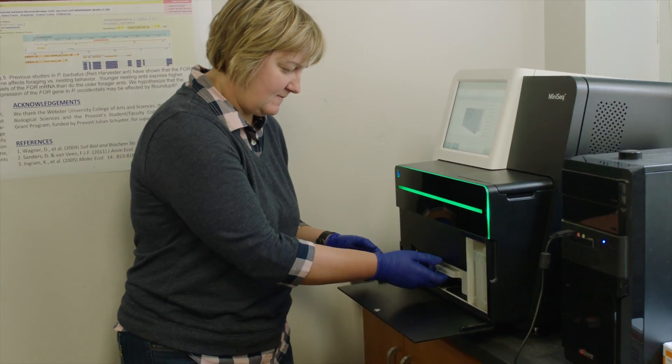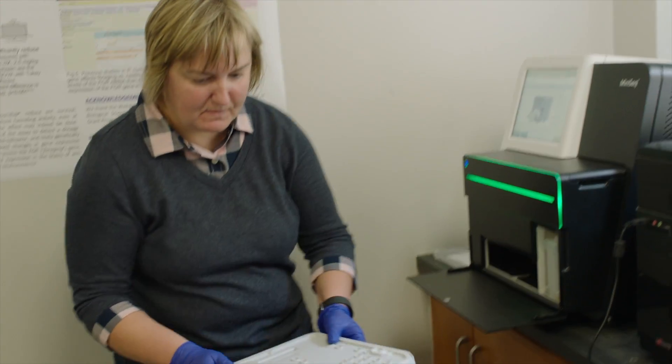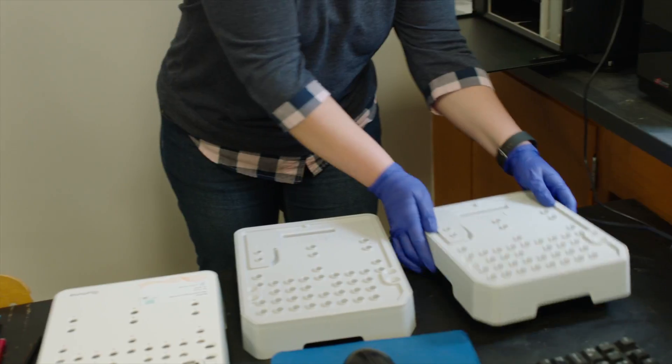When the instruments showed up, the students were saying, 'This looks so cool.' And there were a few students who saw it and said immediately, 'I want to sequence something.'